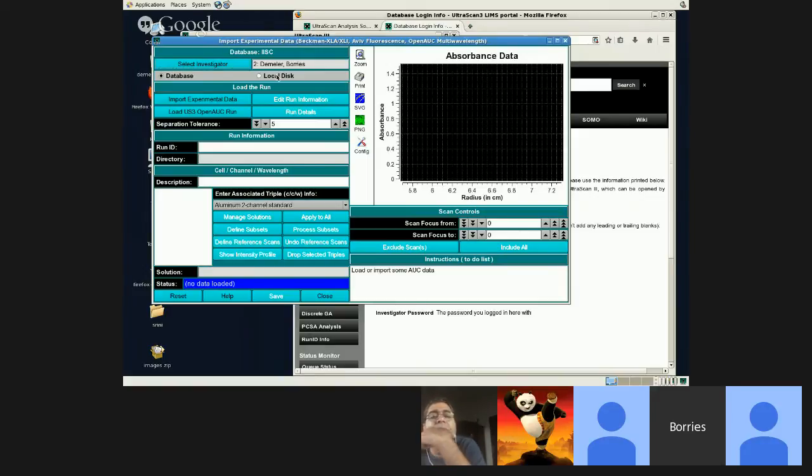So if you're the technician that works on the XLA, that's what you want to do: pick the right users so that they can find their own data later.